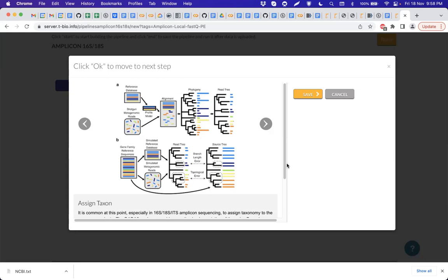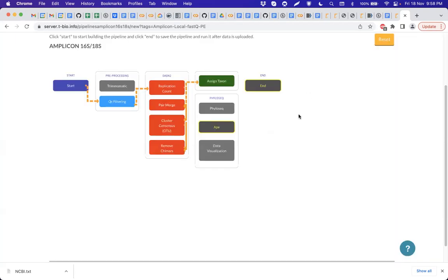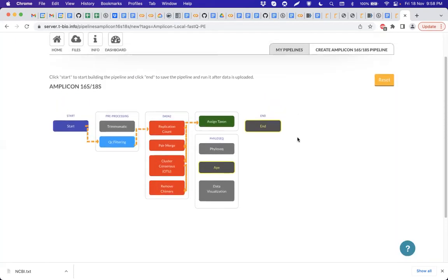You remember that we selected all known databases, and that includes the Silva option, right? So that's where the OTU sequences will be compared to, and their taxonomic identification will be performed by comparing their 16S sequences to the database, the repository. So we don't have to provide a reference sequence; this will become the reference.